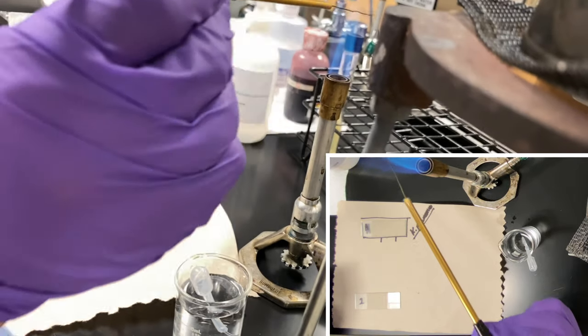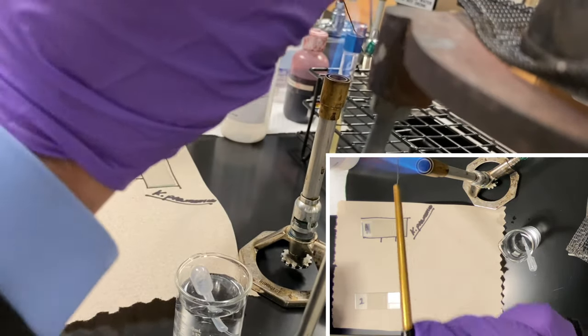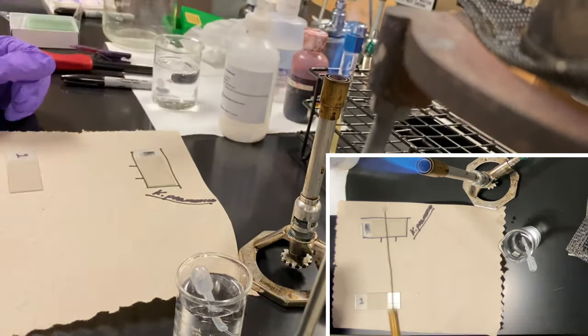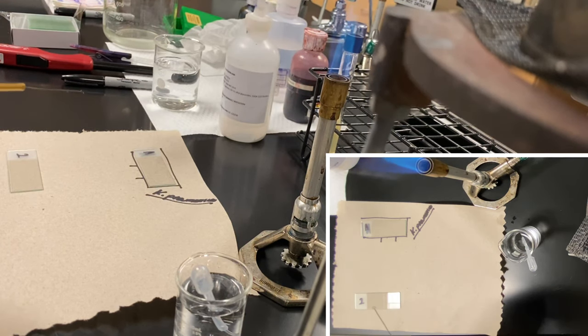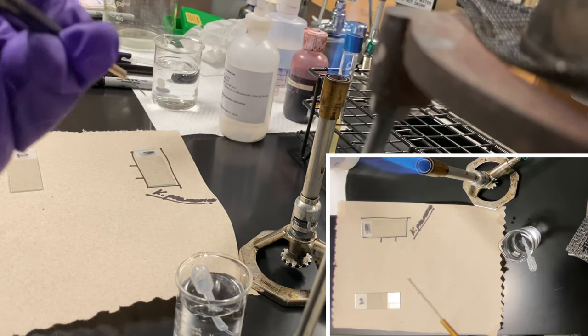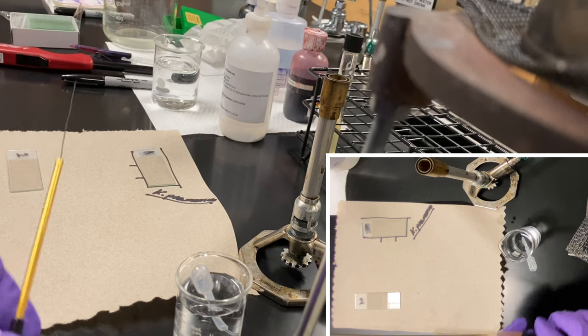Now I'm going to sterilize my loop again. 45 degree angle. One, two. Let this sit. Now I'll close this off. This is sterile.